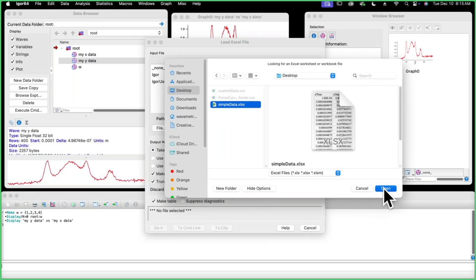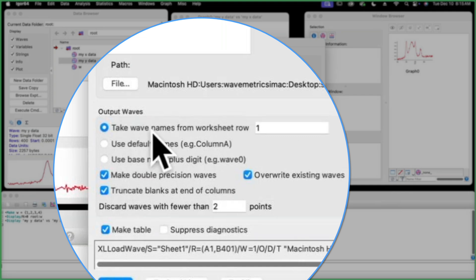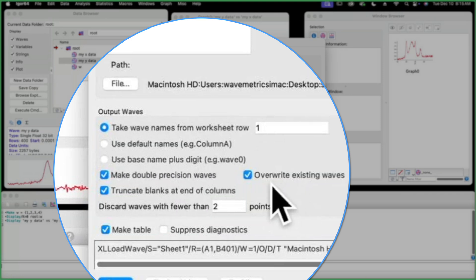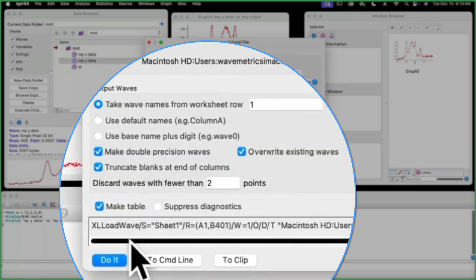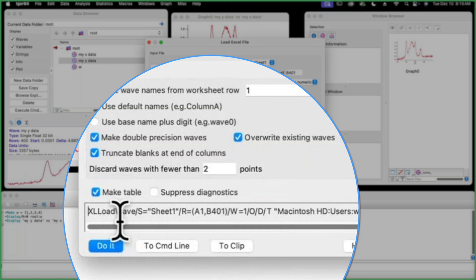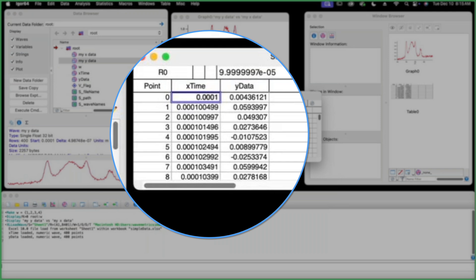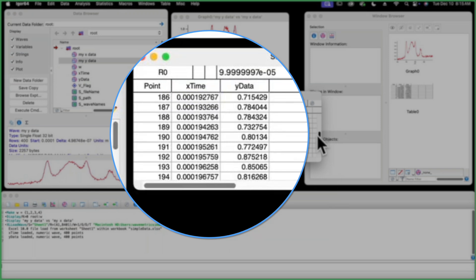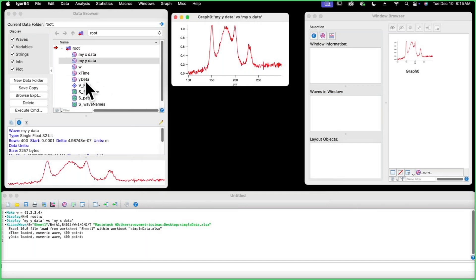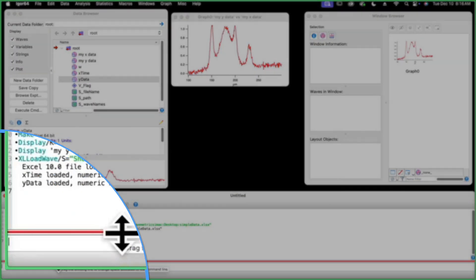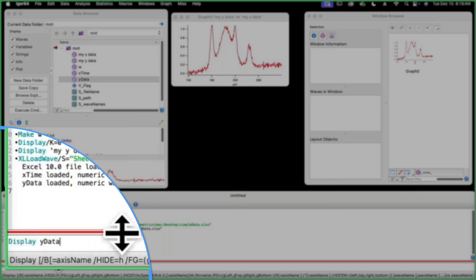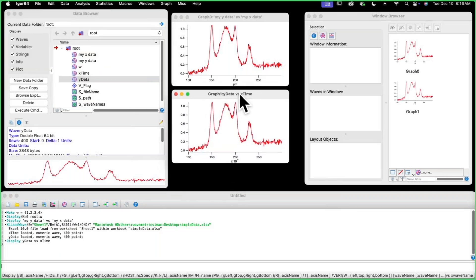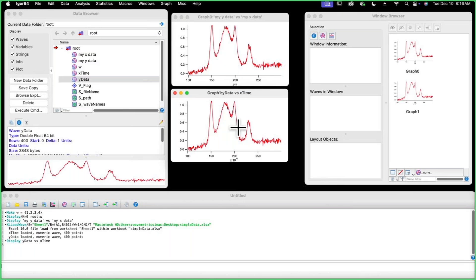We're going to open that. All of these defaults are fine. There's wave names in the worksheet on row one, double precision waves. If the wave name already existed, I'm going to overwrite. I'm going to get rid of the blanks at end of any columns. And here is the command that's going to be generated and run when I hit do it. So here we go. Here's my table. We can scroll through and see that the data came in nicely. Here are the new waves, X time and Y data. Let's graph that again. This is going to be Y data versus X time. I didn't need quotes that time because these names didn't have any spaces or funny characters in them. You can see that the data is exactly the same and the graphs look the same. So that worked great.